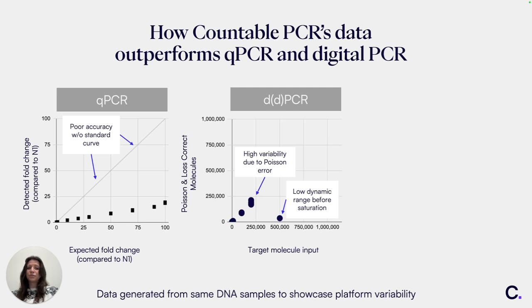That means you need to dilute your samples, which introduces pipetting errors. And it also means that if, for example, you're running a single sample and trying to probe multiple target genes at once, and they're present at different amounts, you're going to have to run multiple dilutions of that sample. And the comparison of those different target genes won't be exactly apples to apples.